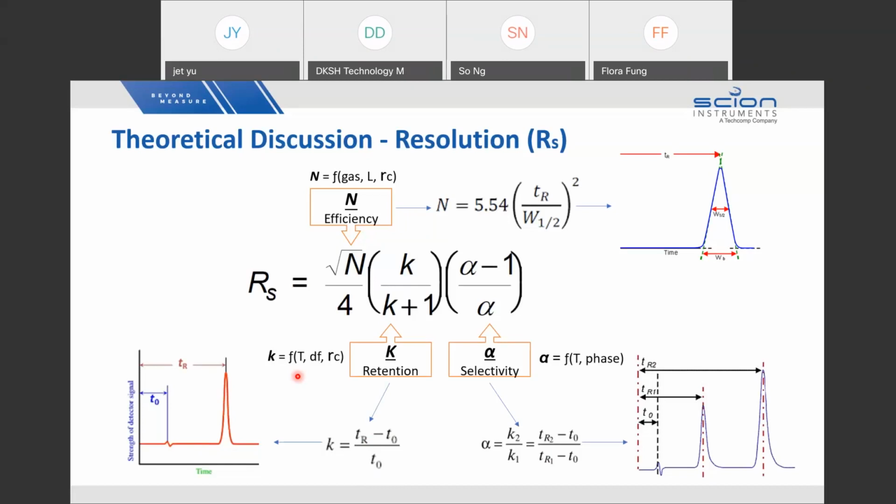Basically the principle to choose the right phase is that like dissolves like. This is more from the chemical properties. Polar likes polar, non-polar likes non-polar, but non-polar doesn't like polar. Just like water and oil, they are not able to be mixed, which means there's no interaction in between. Different components have different interactions with the stationary phase.